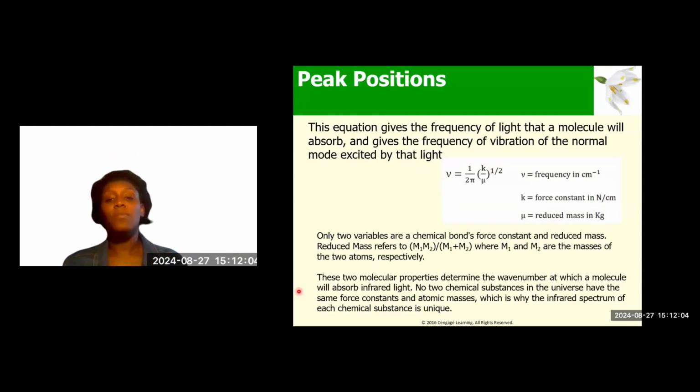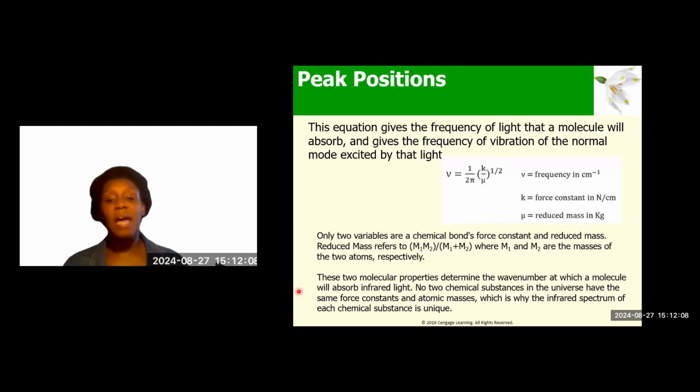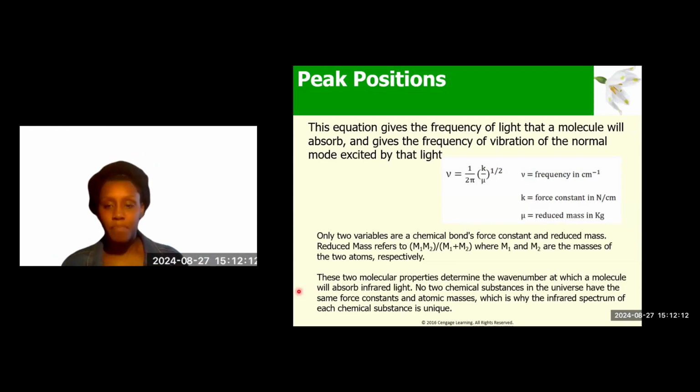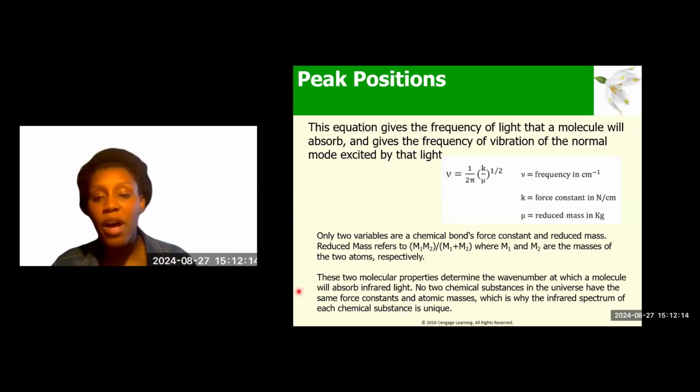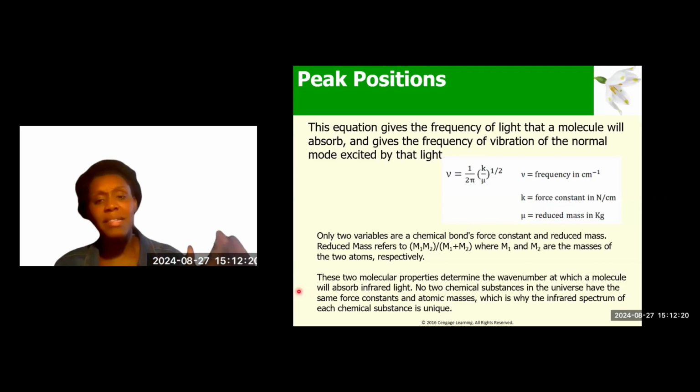All right, so the peak positions, and I'm not going to spend too much time on this, but I do want you guys to kind of understand this, is based off of some constants and some variables, okay? Or I should say some constants.